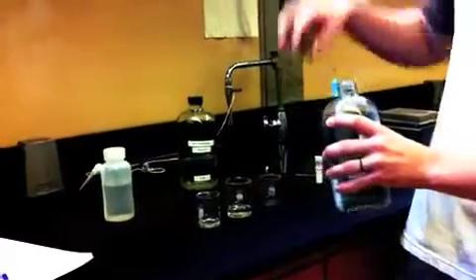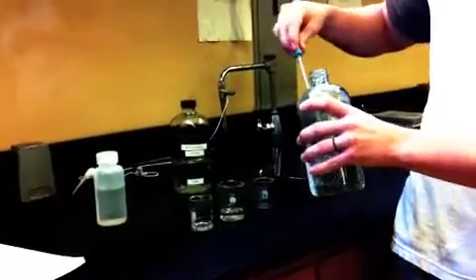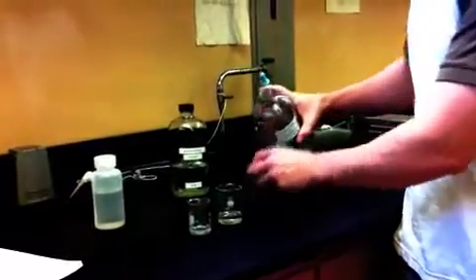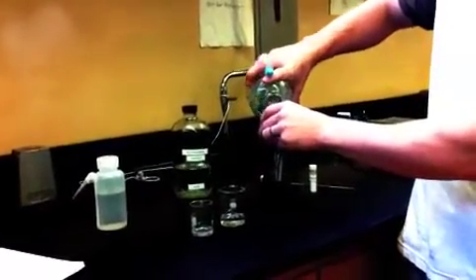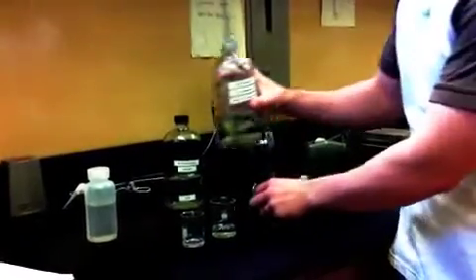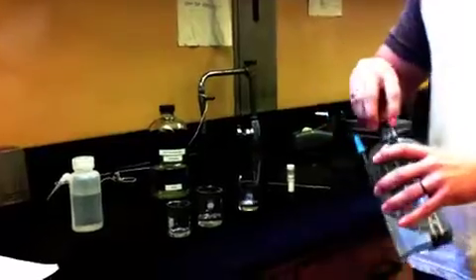So you have to get three different ones ranging in polarities. These ones are given to us in the first experiment so that you can see differences on what a good one looks like, what too much solubility looks like, and what the perfect solubility looks like.